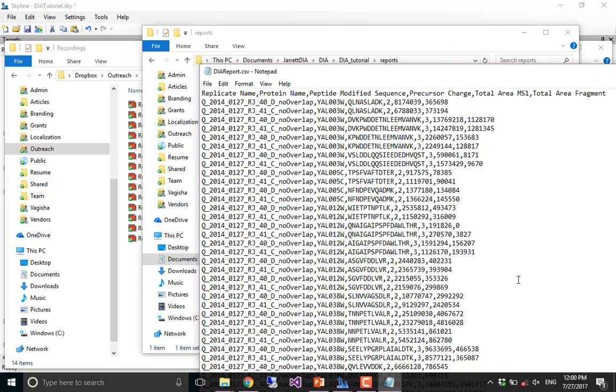No, I'm just asking because sometimes if you have a lot of replicates and you don't do the thing, it ends up that Excel won't. Oh, because it's over 2 million rows. Yeah, so in that case, you should pivot it, if you have a lot of replicates.